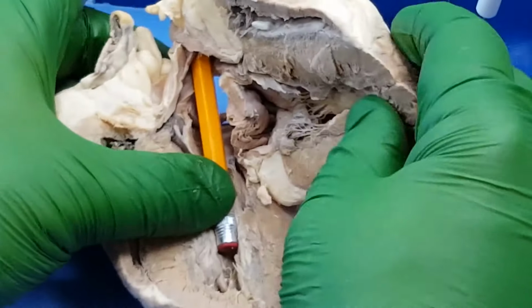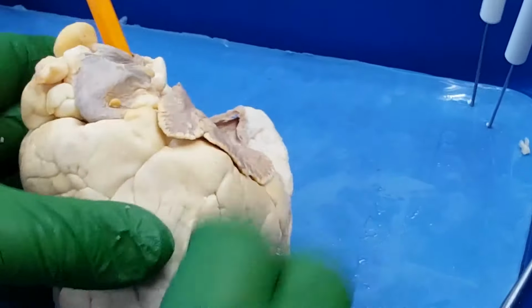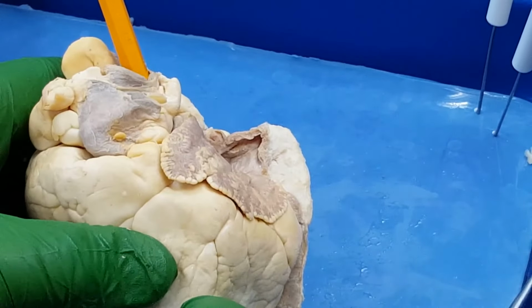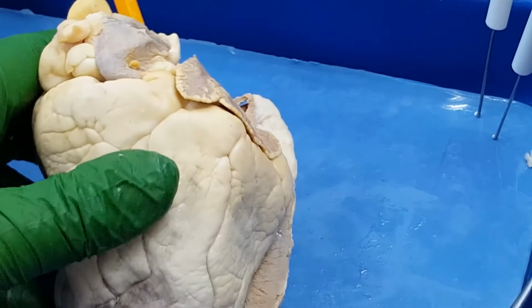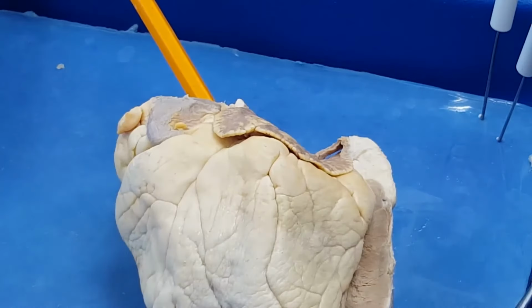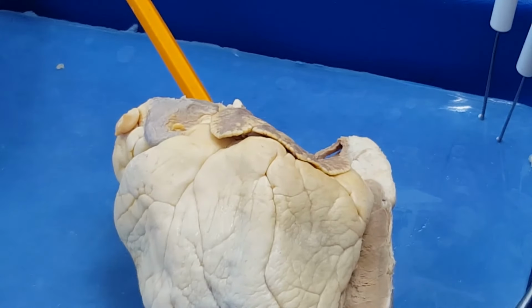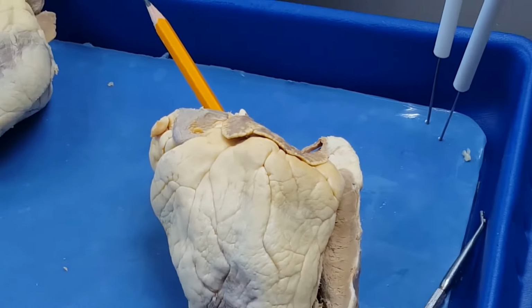So this pencil is in which great vessel? The aorta. This is how you will know. You will look at the dissection. You will look at what chamber this thing ends up in. And let me zoom out a little for you.